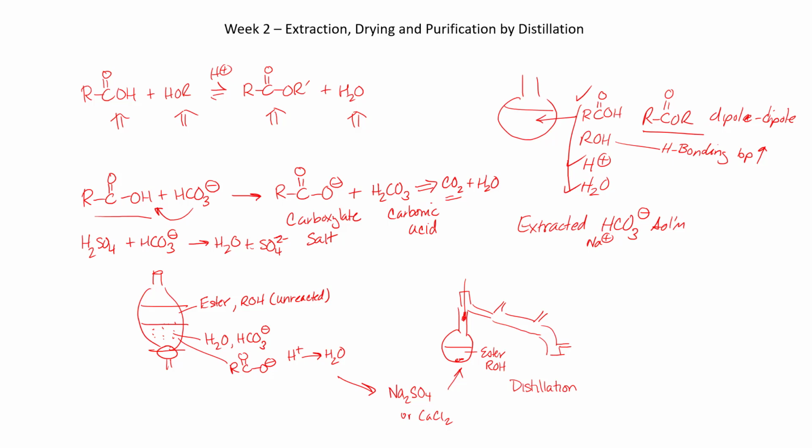Okay, so that's how we would have gone through. And I did not put a separation scheme in this lab report, although you could very easily write a separation scheme for this. Okay, so that's what we would have done in week 2, and we would have had purified ester, as purified as we can get.